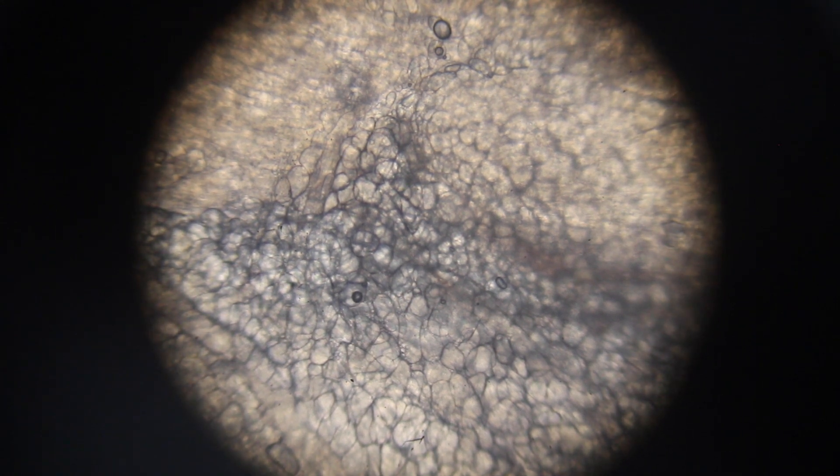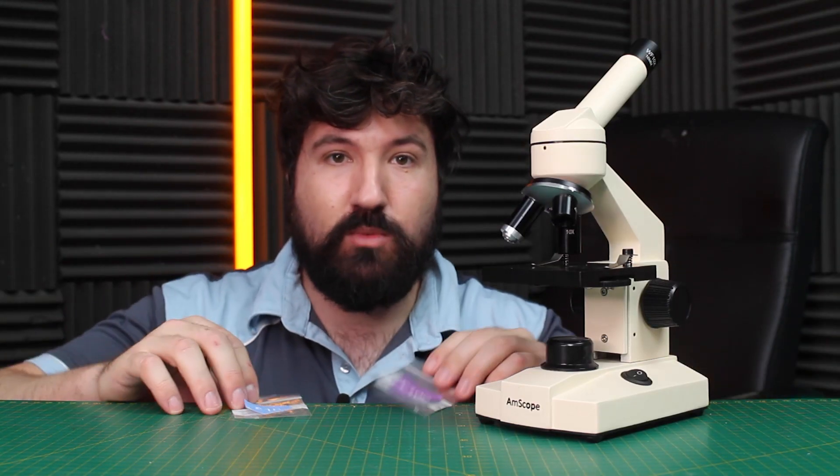Let's compare it with the expensive one and see if there's any difference. Straight away what I notice is this is much much fattier — you've got these fat lines running through it. The grayed-out area is actually the fatty area. What we saw in the cheap cut was just an air bubble — I double-checked. The muscle fibers look much longer, and generally I would say more healthy. I always find it so interesting seeing things we take for granted every day at this level.